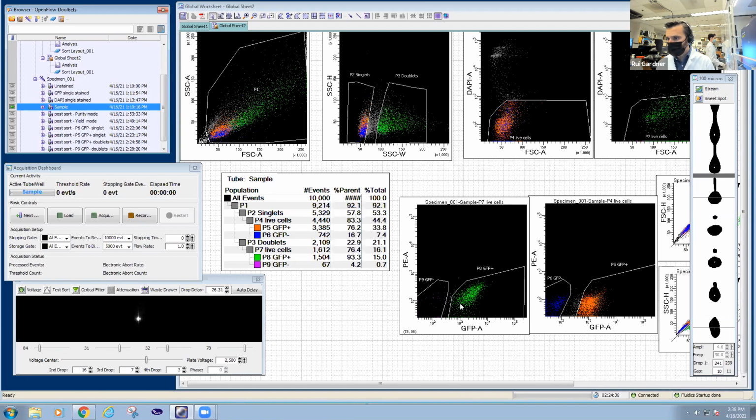So that may be the case. And here the frequency is also much lower, right? 7 versus 33. Sometimes you get away with things, don't you, by luck. Quite often you get a good purity, which is great, but your yield is very low, your recovery is very low.